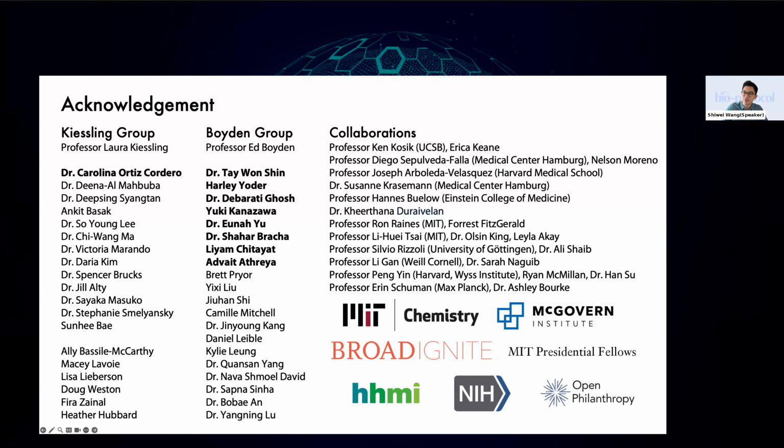Cool, thanks. Can you use this method for nanoscale synapse level connectomics and neurite tracing? Yeah, I think it's definitely possible since we can visualize nanostructure of synapse and we can visualize the neural processes. We haven't performed any tracing with this technology in our lab.